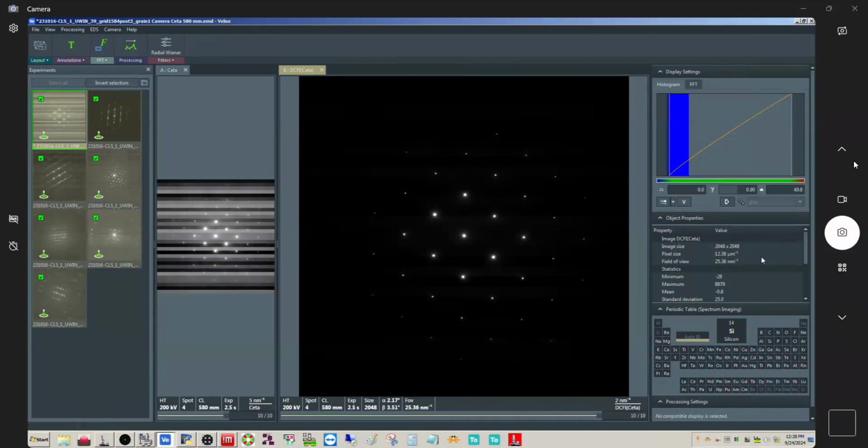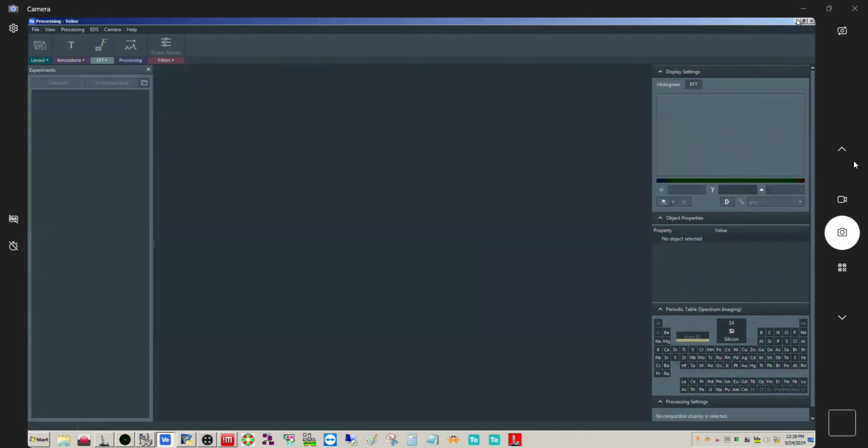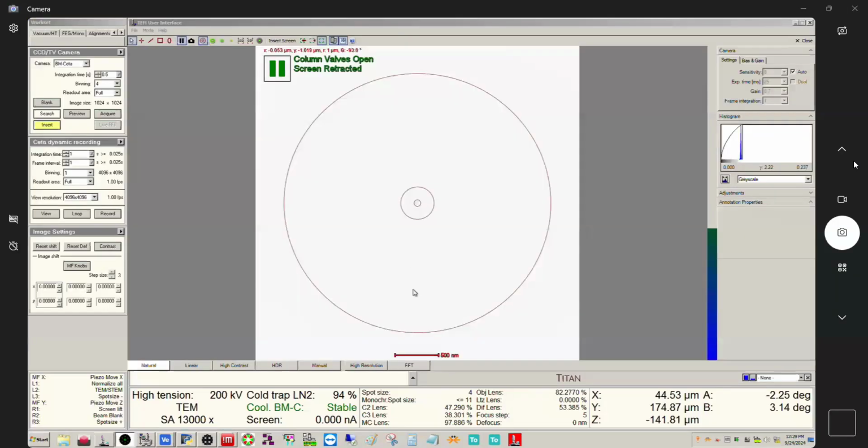You're talking about an 8,800 count difference. So the point is, this is what you need to be looking at to make sure that you don't potentially harm the camera. So close all these. And with that in mind, we are going to go through how to do this. We'll go through the trick again, and we will do this a little more safely.